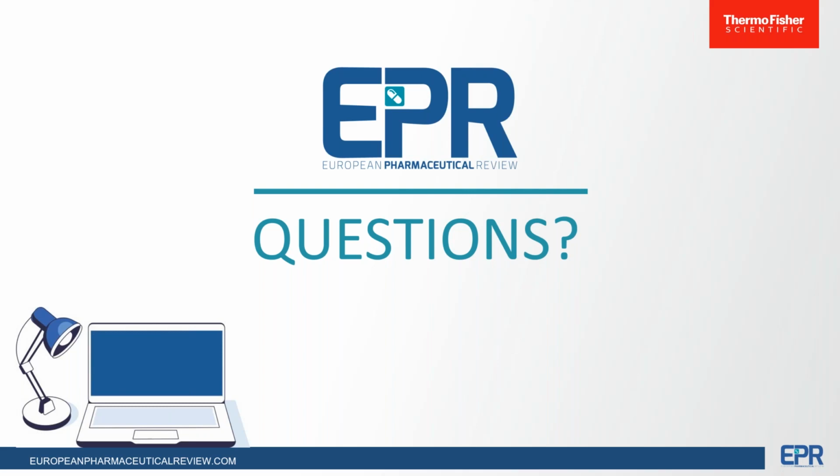So let's take a look at our first question. Shailesh, can you tell me, can you use Raman or FTIR to determine the solvent contents in drugs to the permitted levels?